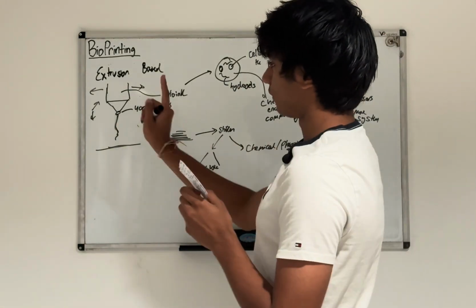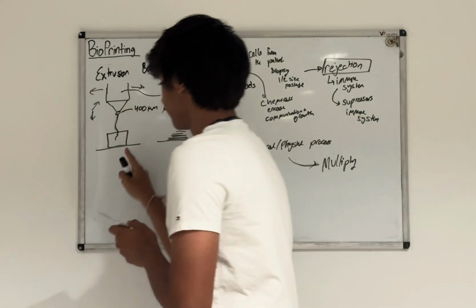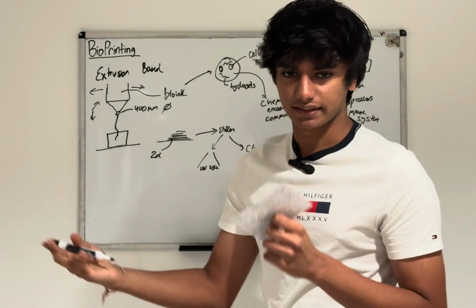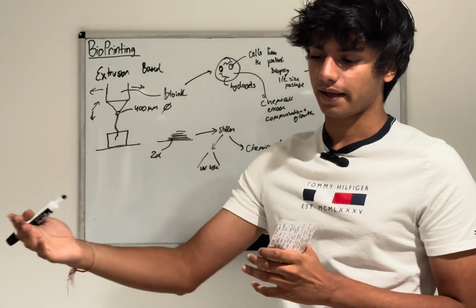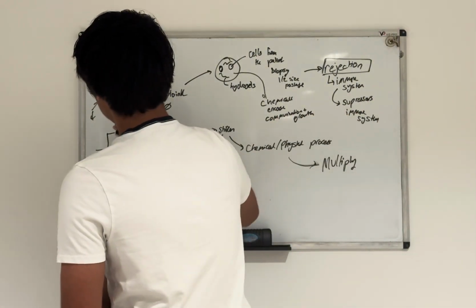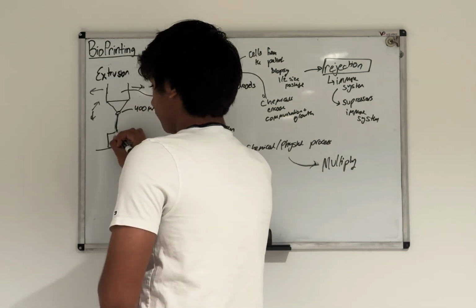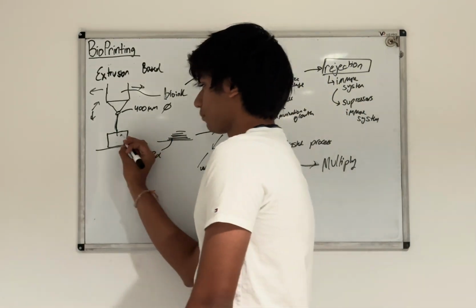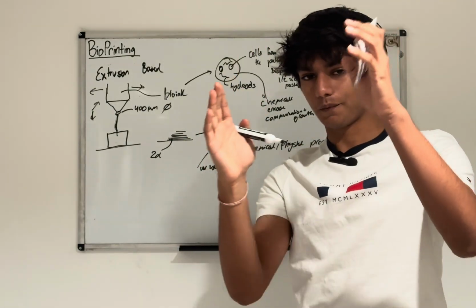Another thing that bioprinting does is sometimes they have this gel here, because the issue with this printing system is you can only really print 2D stuff or very basic 3D structures. And so to make more complex structures, you sometimes have this biogel, and you have your nozzle that extends inside the gel. What this gel does is it suspends the bioink in place. So you can now print three-dimensionally, and your bioink is going to be structurally supported by the gel.